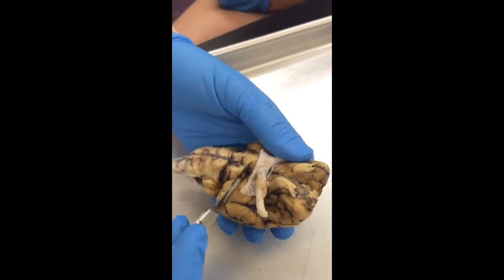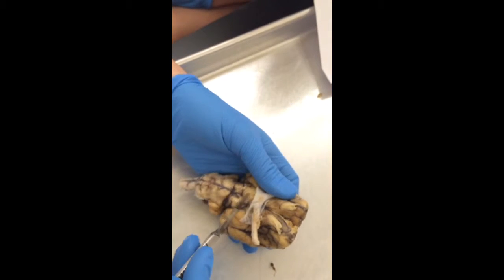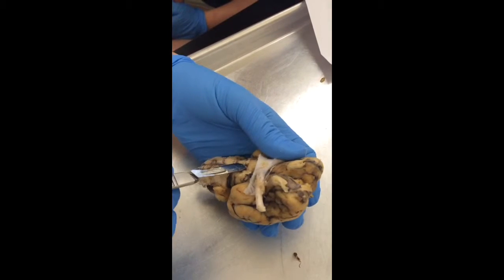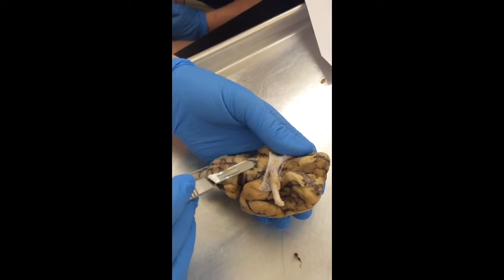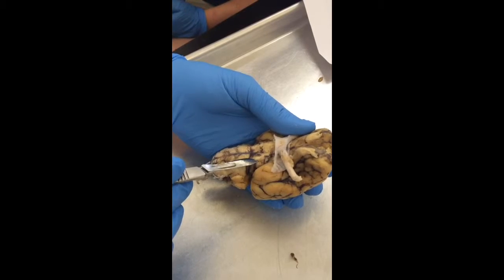Then underneath here we have 3 structures, 1, 2, 3 in that order: infundibulum, tuber cinereum, and then the bottom, the rounded part here, is the mammillary body. So it goes infundibulum, tuber cinereum, mammillary body. Right there are your cerebral peduncles.